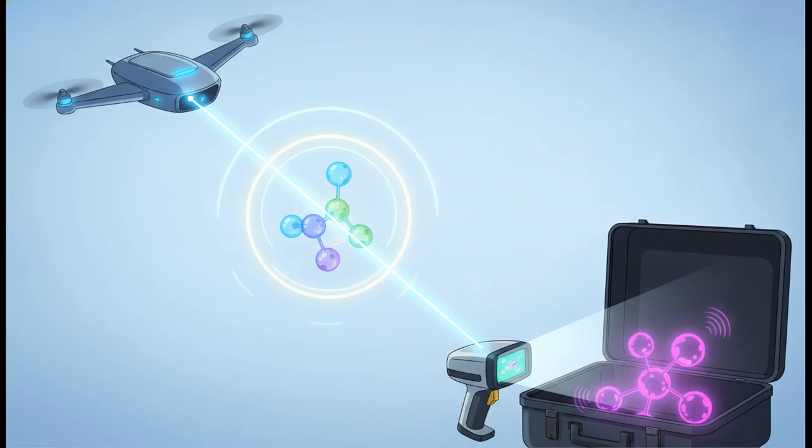And the applications scale up massively. On environmental and military fronts, the sheer sensitivity of laser photoacoustic spectroscopy is a literal lifesaver. We can deploy it to safely and continuously listen for invisible threats at parts per trillion levels. Whether it's sniffing out ozone-depleting gases high up in the stratosphere or continuously monitoring for highly toxic nerve agents and explosives, this tech is out there sensing the invisible in real time.